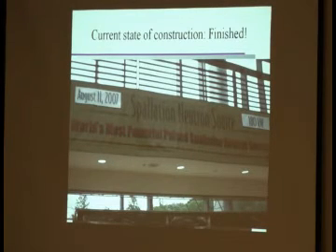But the nice thing with this source was, this was the first time that neutrons could compete with some of the older synchrotron sources in terms of the types of experiments that you can do there with respect to the flux that you get on your sample. Okay, so this was really a very big step when that one was built. And the instruments are now slowly coming online. Several of them are already available for users. Several other ones are scheduled to become available over the next couple of years. So some of you might even go there.